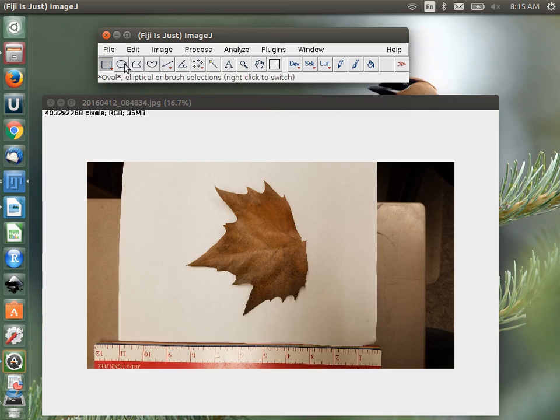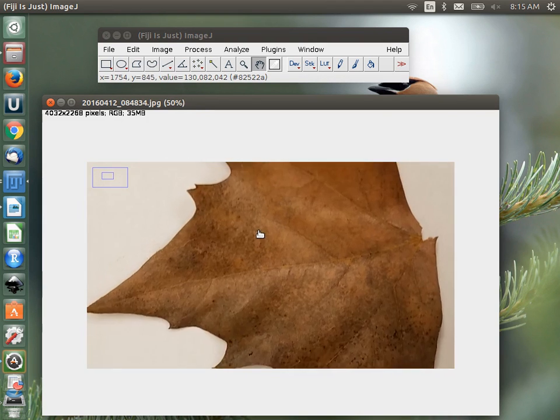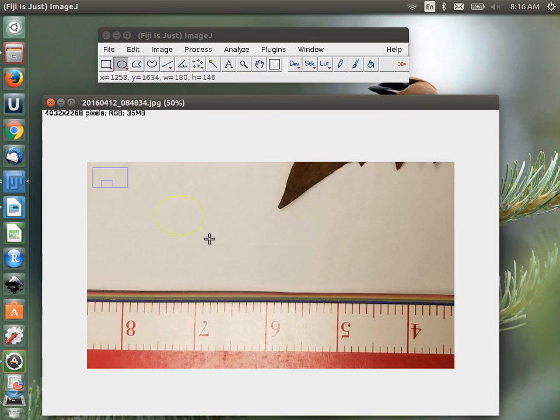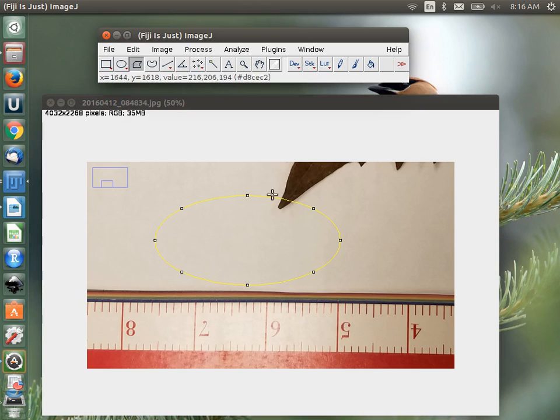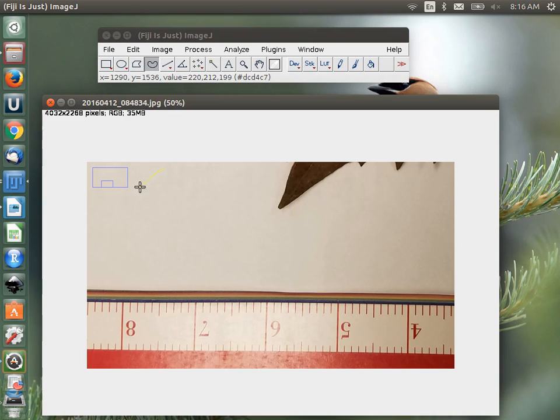Let's go to Set Scale. Below the menus, we have a bunch of different ways of manipulating the image — little tool boxes. We have a zoom tool, a hand tool to move around the picture, a box selection tool, an elliptical selection tool, polygon selection, freehand select, and the line select tool, which is the one I want at the moment. Down here I have my scale.